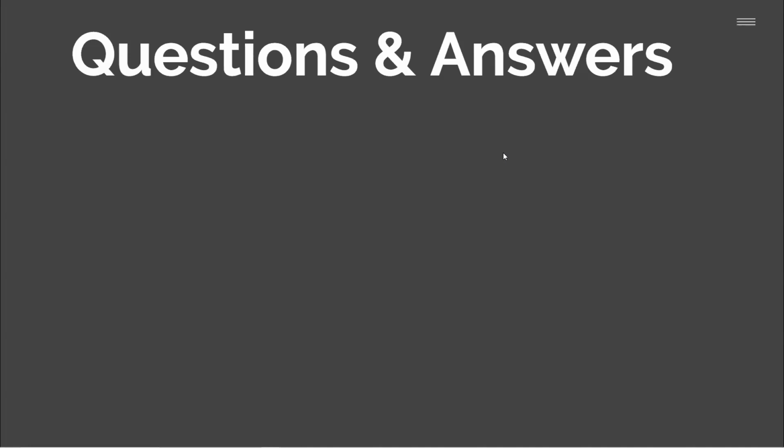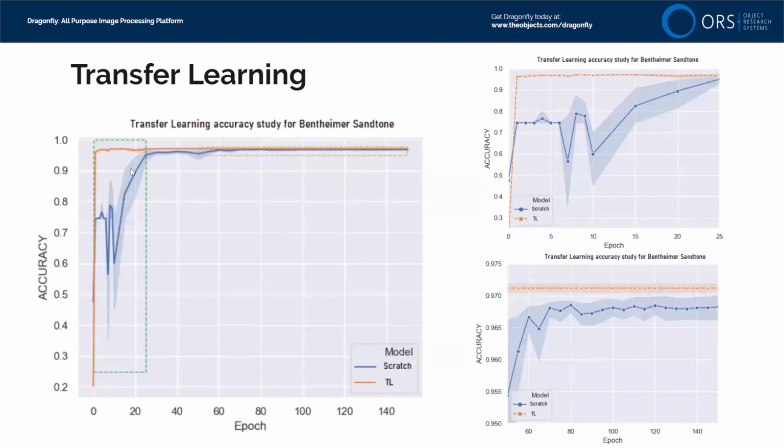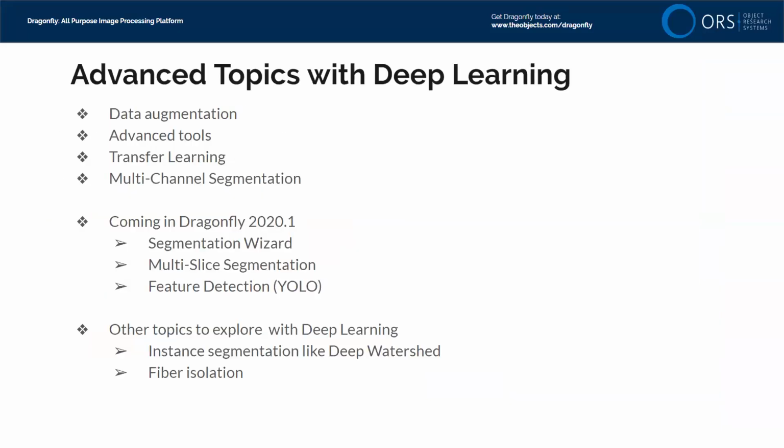So in the transfer learning studies I was showing you, if you look at those plots, you see there are sort of error bars. Benjamin has trained 5 or 10 networks each time he's doing these experiments, and because it's stochastic, you don't get the same answer every time. And of course, in these cases, he wants them to all run for a full 150 or 200 epochs, so he doesn't want to have early stopping. I think Benjamin just told us it might be a good practice to have early stopping by default. And maybe we can follow up with that later and maybe some more best practices. But there are cases where you wouldn't want to always use early stopping.